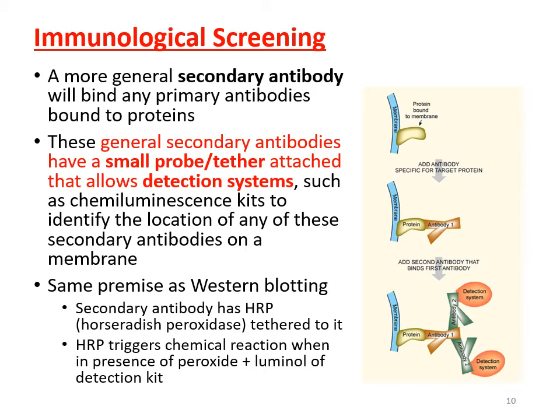And keep in mind through this, whether it's hybridization or immunological, you still have the original plate of bacteria. It's kind of like you made a copy of it, right? So once you find the location with the fluorescent detection, you know exactly which colony to go grab and allow to grow.